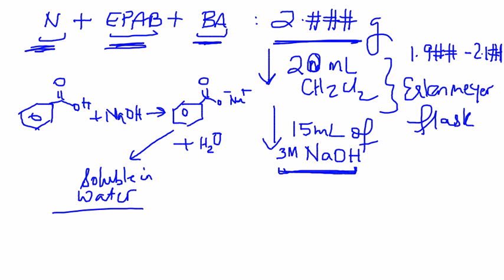Because you have dichloromethane and water, you're going to see that two layers will be formed, and you're going to transfer this entire mixture into the separatory funnel, which is a part of your distillation kit, by the way, and you guys are going to start checking in and checking out the distillation kits. So you're going to use a separatory funnel, put this entire mixture, the 35 milliliters concoction, which contains dichloromethane, sodium hydroxide, and your original mixture, all of that in the separatory funnel. You're going to then put the glass stopper on top and then go shake, shake, shake.